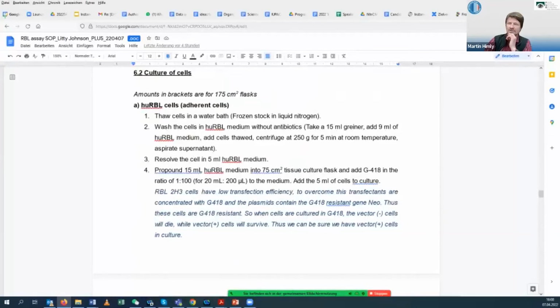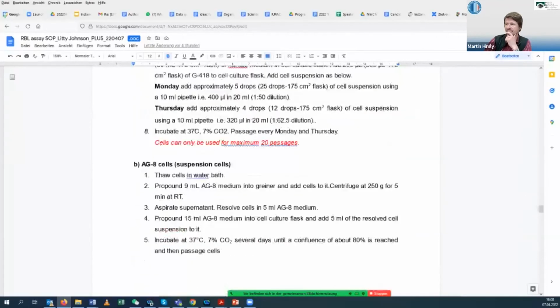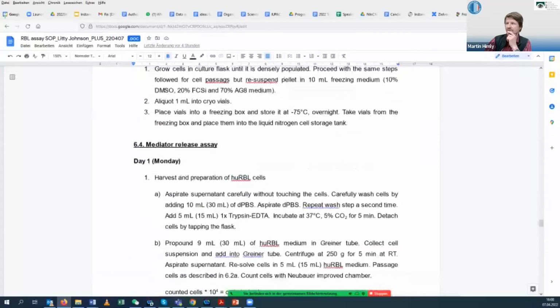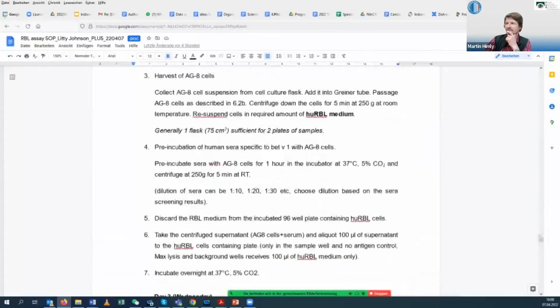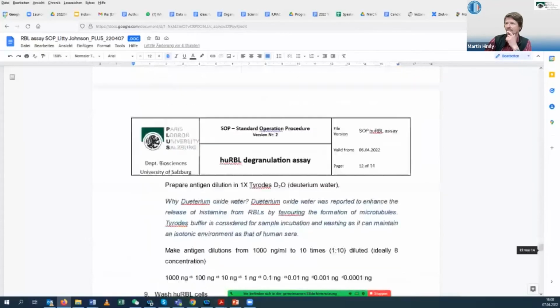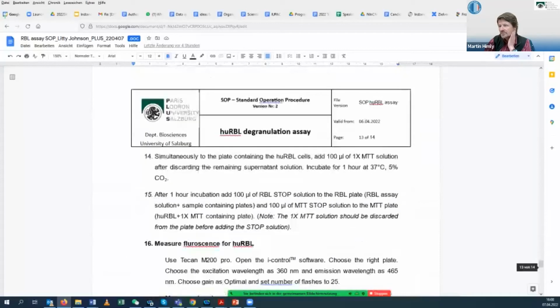And then you go into the protocol, basically a nice detailed description of the protocol. I'm not going to go into detail of that. It's taking more than 1 day, this protocol as a whole. But as a pre-requirement, I'm scrolling along now and I do not find this.